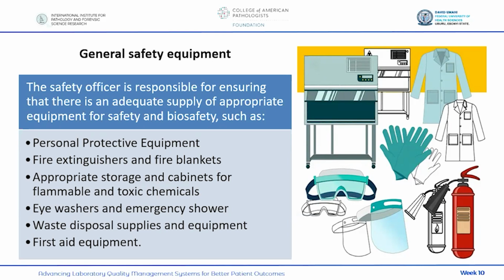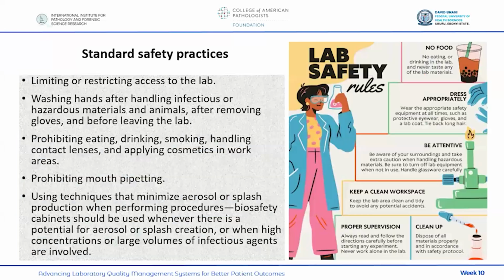You know, one very general thing about safety is that we keep talking about it. When you ask anybody what are safety equipment, people rattle it off. But the problem begins when you visit a lab and you say, please, can I see your first aid equipment, your first aid box? Problem starts. The lab might have it, but it might be somewhere covered with layers of dust. Nobody has checked it in the past two to three years. Okay? All these things, eye washers, all these things we are talking about, we may know them, but how do we implement them? How often do we check them?